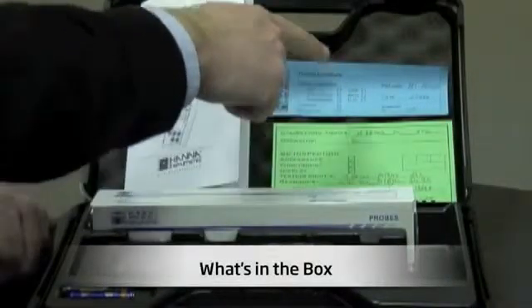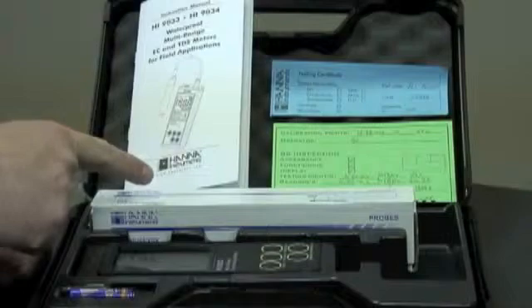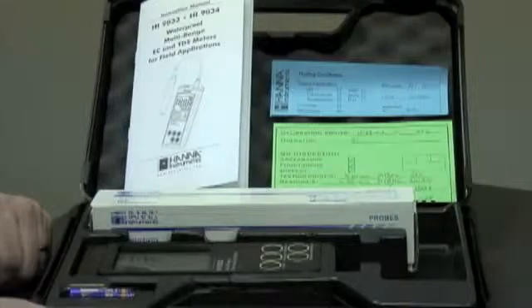Here we have the calibration certificate, the testing certificate for the probe, the instruction manual, the electrode itself, the meter, batteries — all contained in a rugged plastic carrying case.